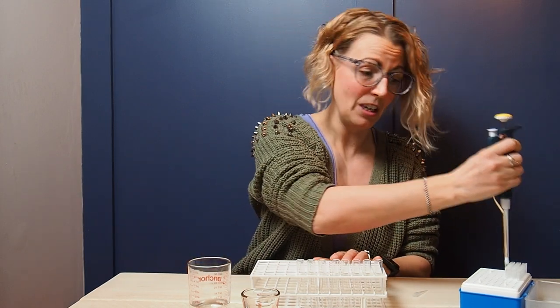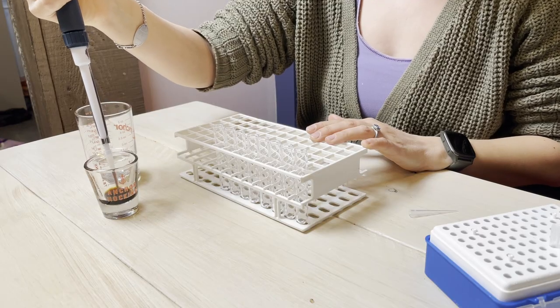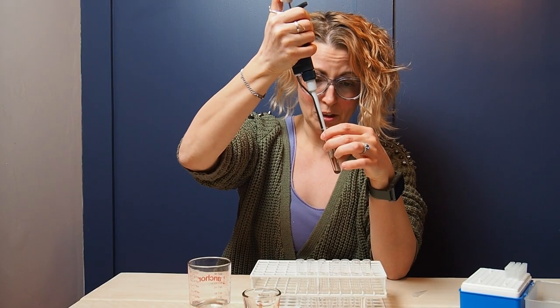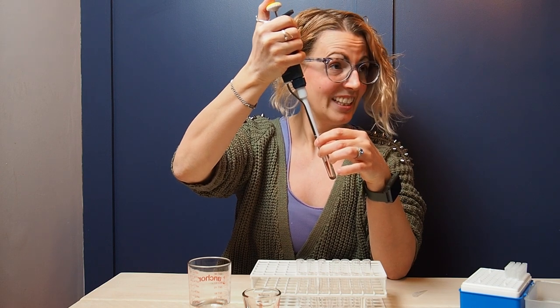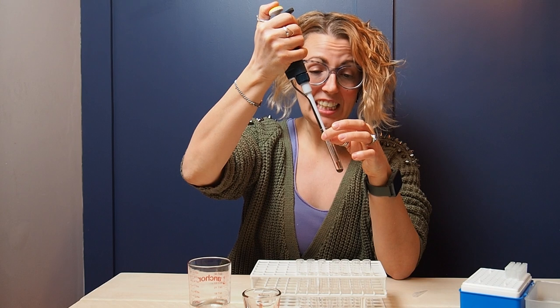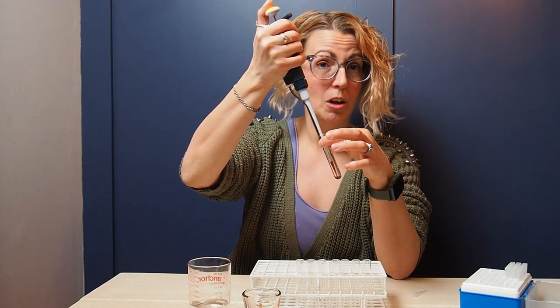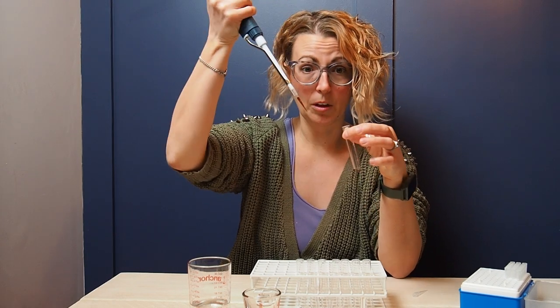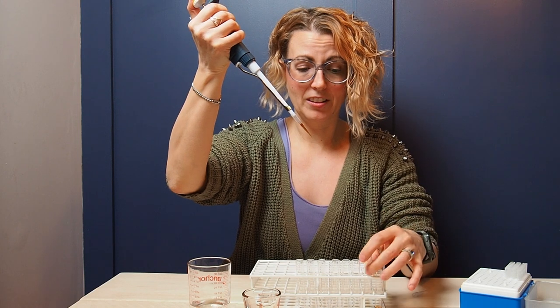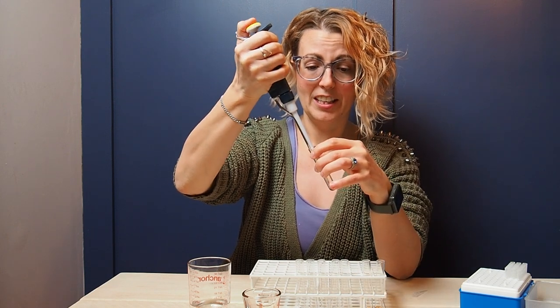So let's get adding our soy sauce. For a one-in-two dilution I'm going to add 100 microliters of my soy sauce into my first tube, and then pipette to mix. Once everything is evenly mixed, because I'm doing a one-in-two dilution series, I'm going to pull out 100 microliters and take that into my next tube — mix, remove 100 microliters, and go into my next tube — and so on all the way down your dilution series.